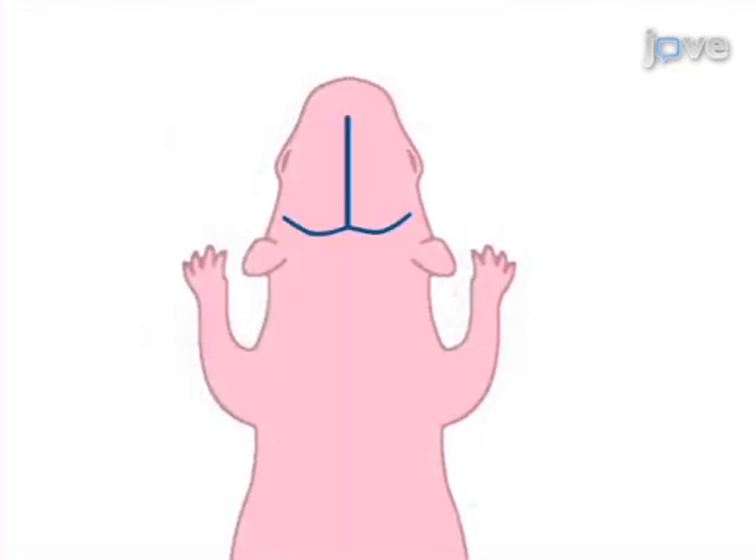Next, identify the injection site for targeting the lateral ventricles between the lambda suture and each eye, or lateral from the sagittal suture, halfway between lambda and bregma.